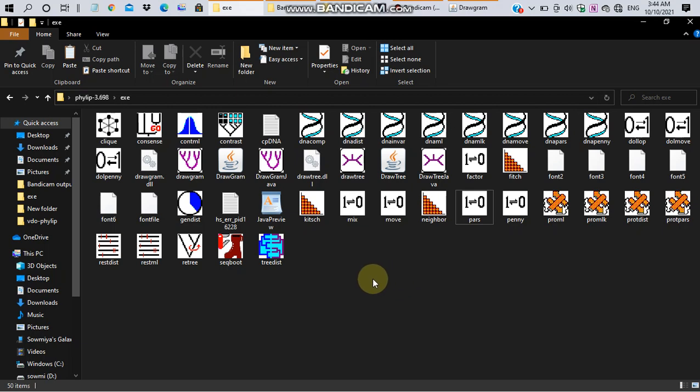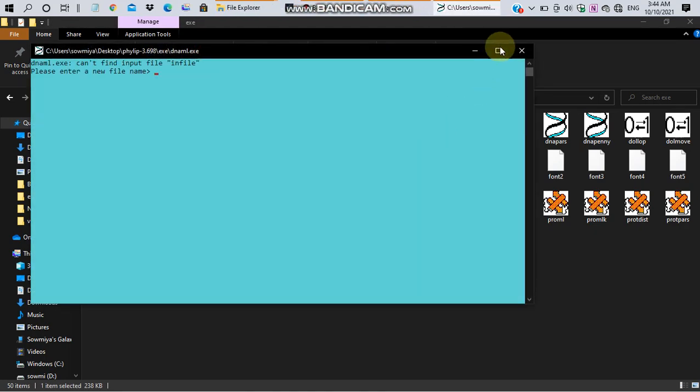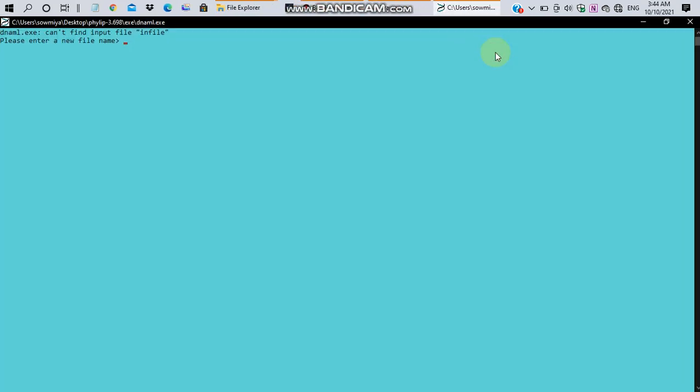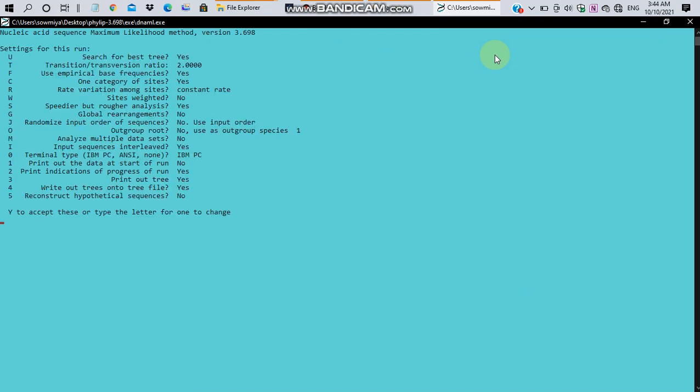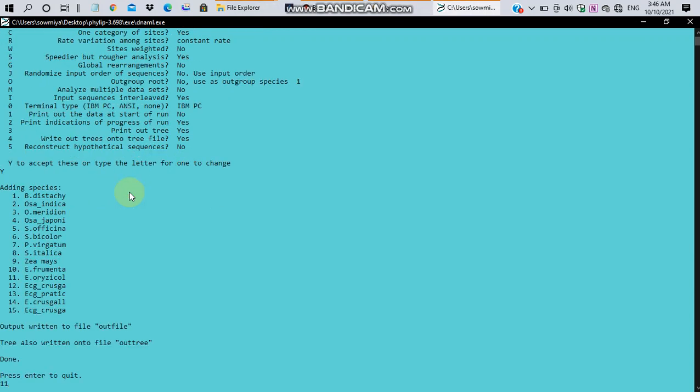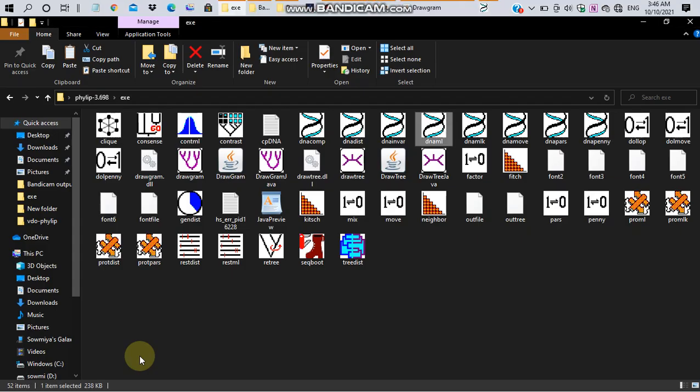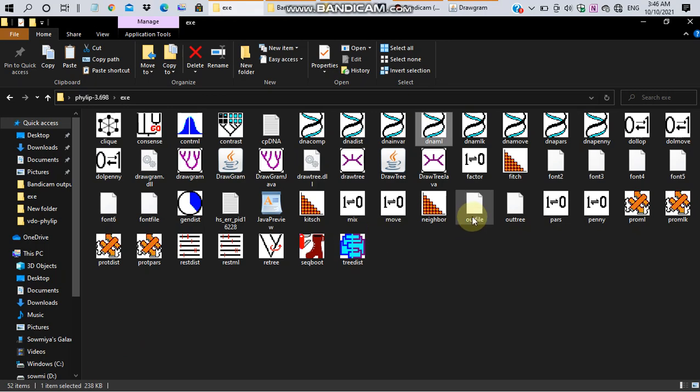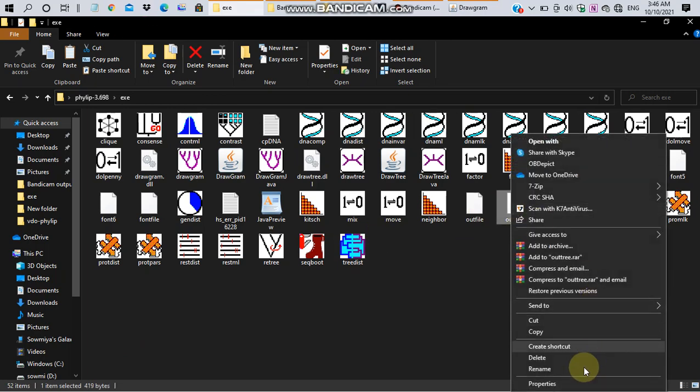Let's go with maximum likelihood method. For this, go to DNAML and enter the file name cpdna.txt then click enter. This will load the parameters for constructing tree. Enter y to accept this parameter. After this step, both outfile and outtree is generated. Just rename outtree as intree.